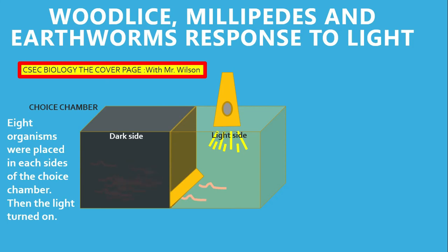Another worm has had enough of the brightly lit area — no privacy, exposure to predators, and exposure to desiccation, being dried out. As such, this organism is not going to stay there any longer and has moved to an area that is much darker and safer. There are three busy worms still not comfortable on the dark side, continuing to move, trying to find something better. Finally, the last worm in the lit area has had enough of the bright light and has moved away into the dark area, seeking cover.